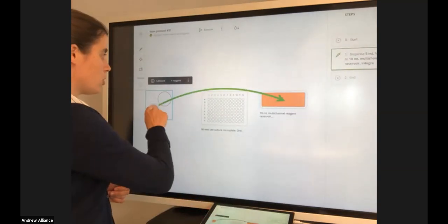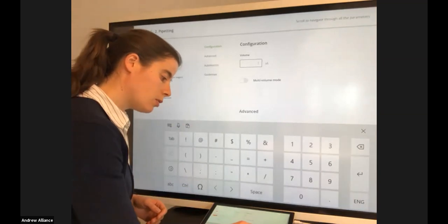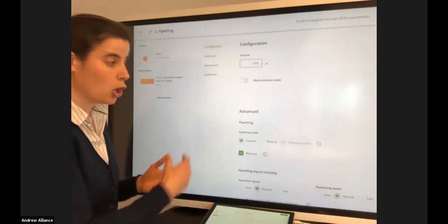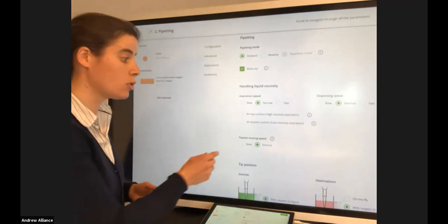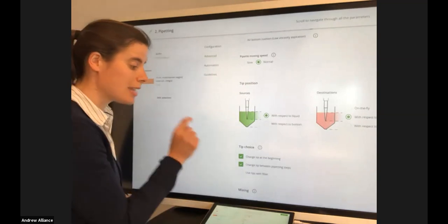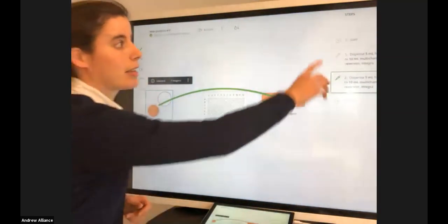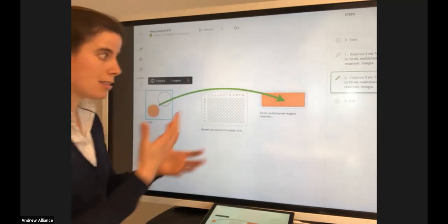We can now create a second step, just to make sure everyone understands it. Click and drag from the source to the destination, your volume. So again, let's say 5 ml. And you'll notice as well that we have advanced pipetting parameters built in. So you can change between reverse pipetting, repetitive pipetting. You can indicate if you're using highly viscous solutions, highly volatile solutions. You can even say where the tip position should be. In this case, I would like to use the same tip from step 1 in step 2. So I'm just going to say, please keep my original tip. Save step. And there you see on the right-hand side again, you have your second step, 5 ml from your tube to your reservoir. And this is how we can keep completing the protocol.